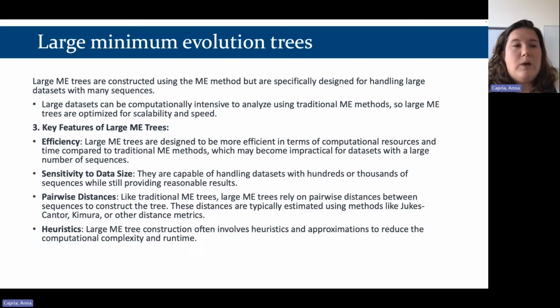And so thinking about runtime, with the BV-BRC services, the size of a genome or whatever you are trying to compare, so if it's a specific protein or a genome, as the size increases, if one run of 10 nucleotides, we'll say, takes you 15 seconds, then if it was 100 times larger, so 1,000 nucleotides, then that would take 100 times as long. So that's important if you're thinking a job that you expect to take a short amount of time might take a lot longer if the sequences that you're working with are longer. So that's a 1-to-1 increase in time.